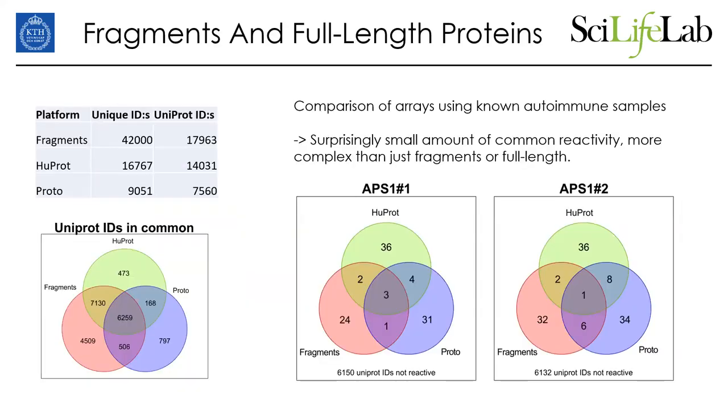So, of course, using fragments is not the same thing as using full-length proteins, and we're quite often asked how they compare, and I have to say that we actually don't really know. We have done some tests and tried to observe what happens when we analyze samples on fragments and then on full-length proteins. But it seems like it's more complex than just whether it's fragments or full-length proteins. And this kind of visualizes that.